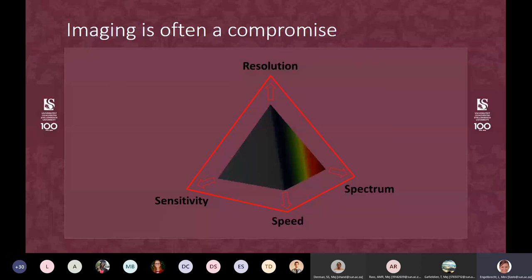Right, now, unfortunately, we would all want to be in front of a microscope for the shortest amount of time. We want to do as much as we can with that data. We want to do Z-stacks, eight-color images. We want to acquire for hours, etc. But the thing is that when you image, I always have to decide what exactly my purpose is. Why do I want to image?